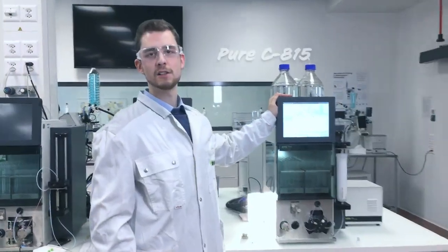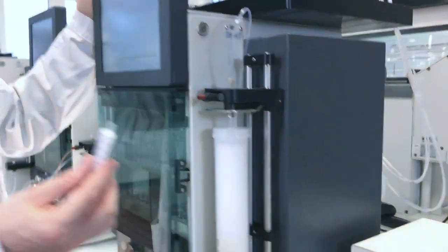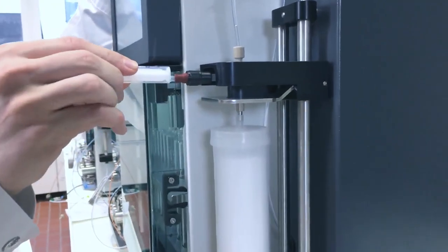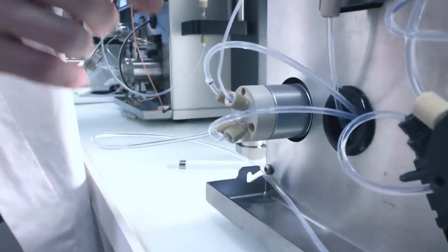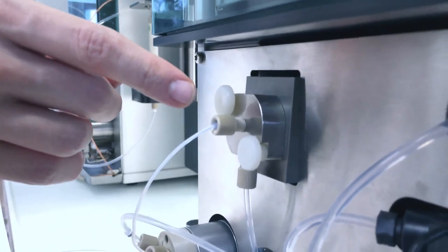So let's see how does that work on our pure system. Your sample is injected here, going through the column, coming out of the column to the splitting valve, and from here into a nebulizer, which sprays very tiny droplets.